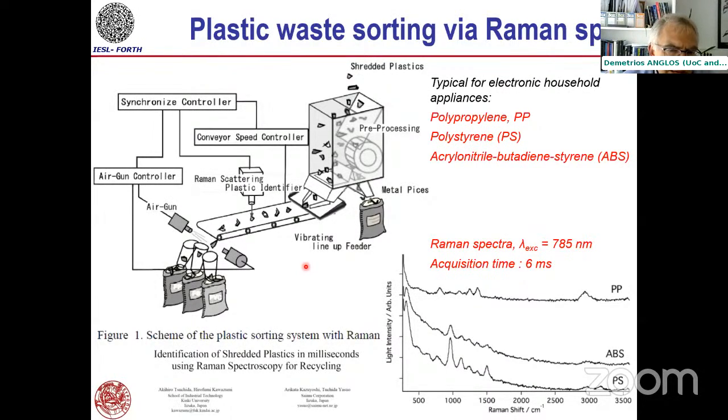We know that the enemy of Raman spectroscopy is fluorescence. So a drawback of this technique is that if you have fluorescent waste plastics, they will not be recognized.